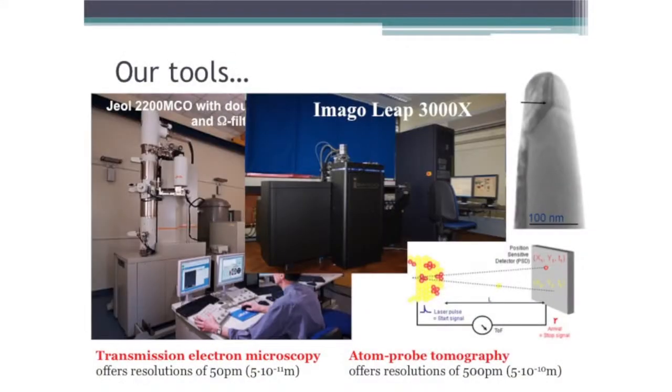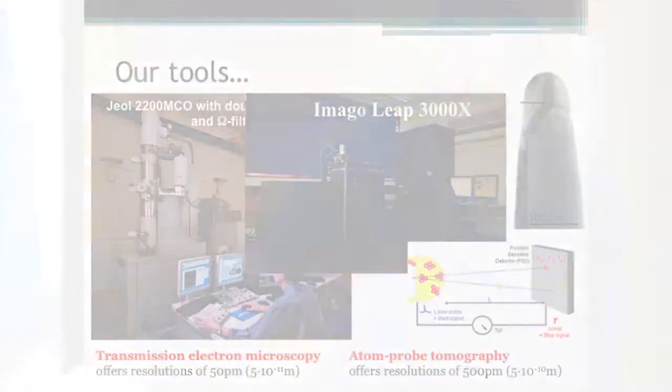That's what we use when we want to look at atoms. We have electron microscopes. They look like this. They can be quite tall. This one is 3.5 meters tall. They cost about 2.5 million pounds. They normally operate in ultra high vacuum because electrons cannot travel in air for very long. So they are generated here, you put your sample there, and you have all your detectors here. And we can see things which are as small as 50 picometers. That is 5 times 10 to the minus 11 meters.